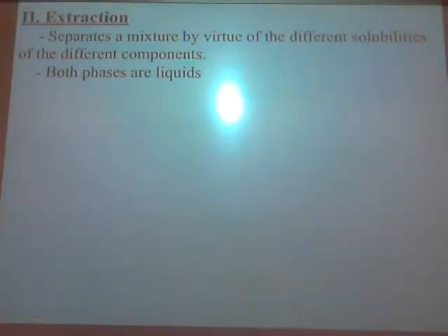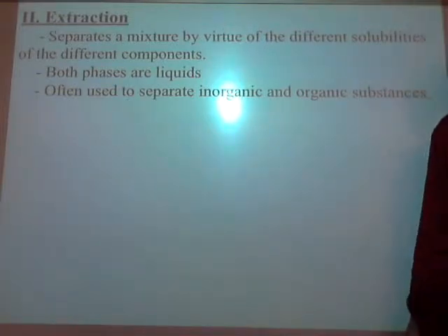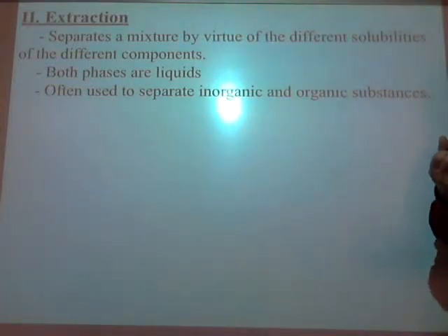Because of that, we have to do it a little bit differently. We have to use special equipment called a separatory funnel. It's used often to separate out inorganic and organic substances. Now, when you see the structure for caffeine, you'll see that it is pretty much organic. It dissolves enough in the soda to be able to drink, but it would dissolve better in chloroform, a non-polar substance, and so that's why we're going to use chloroform to extract it out of our soda.